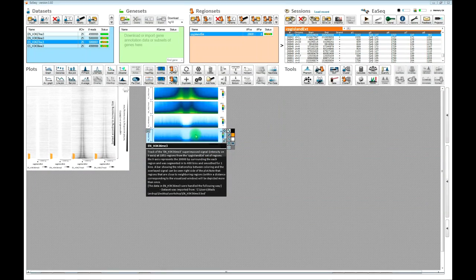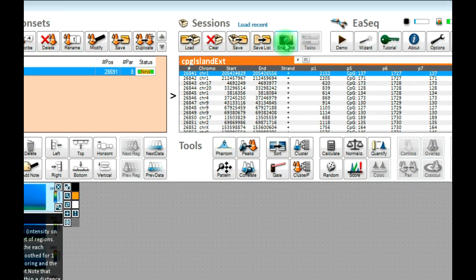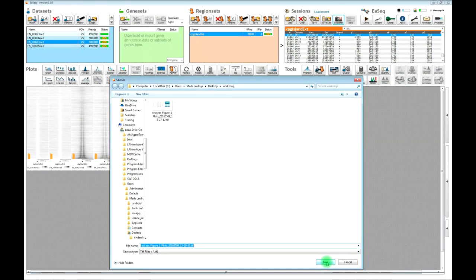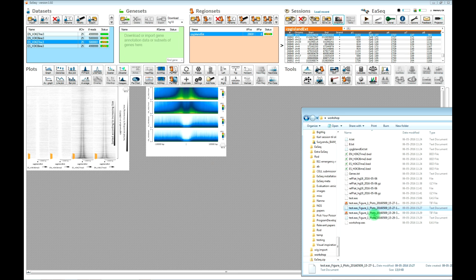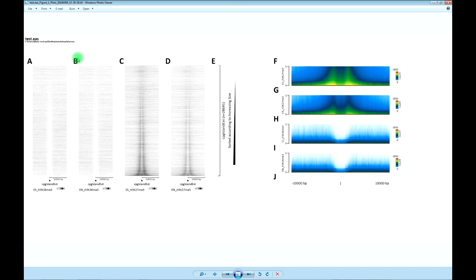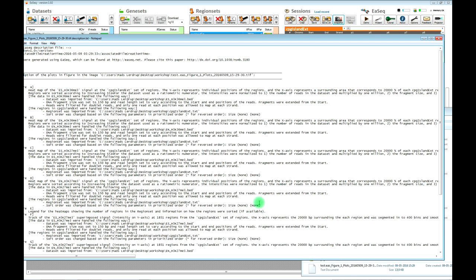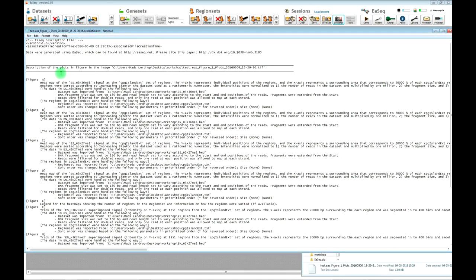Once you have created the layout of the plots you would like to use for a figure in a publication or report, you can go into the snapshot tool. EASEQ will save a high-resolution TIFF file of the plots. By default, EASEQ enumerates all of the plots in the figure as A, B, C, D, E and so forth. In the folder there is also an auto-generated text file with corresponding information — figure A, figure B, figure C, D, and so forth — about how the figures were generated. There is a legend and a description in jargon understandable by life scientists, providing a workflow description you can use for your materials and methods section.